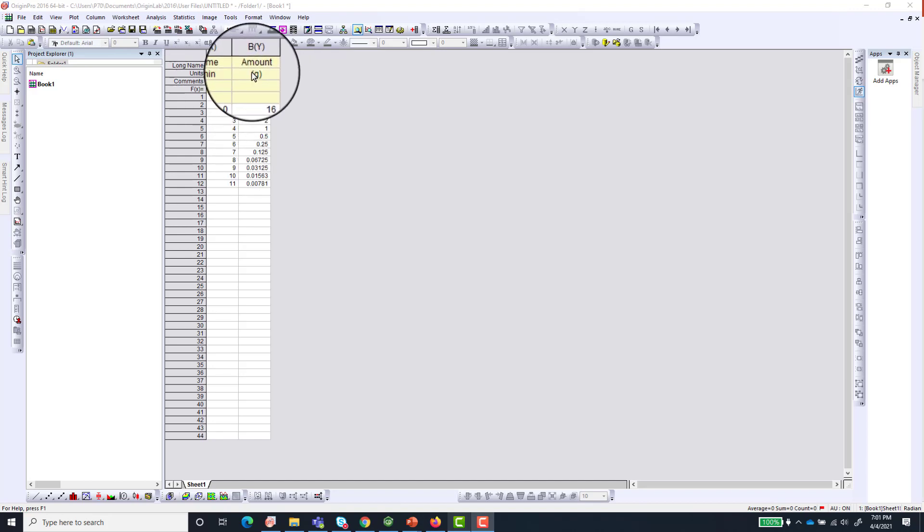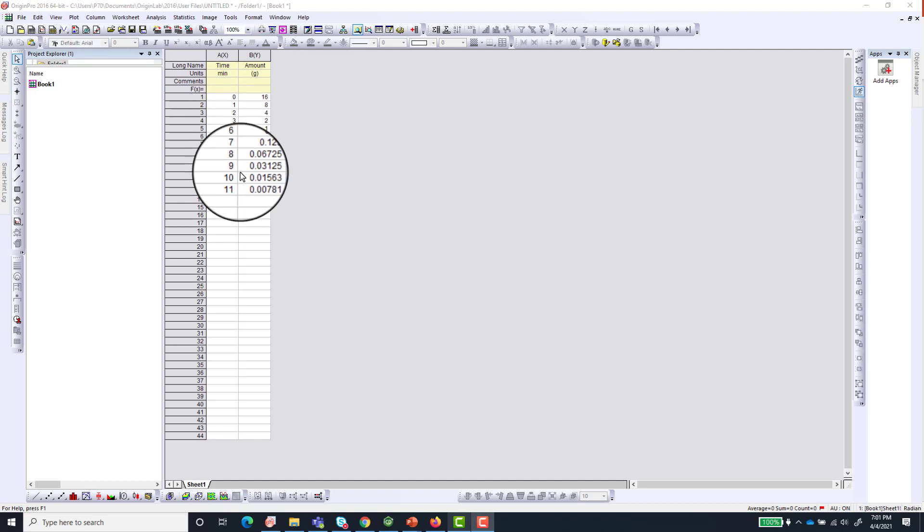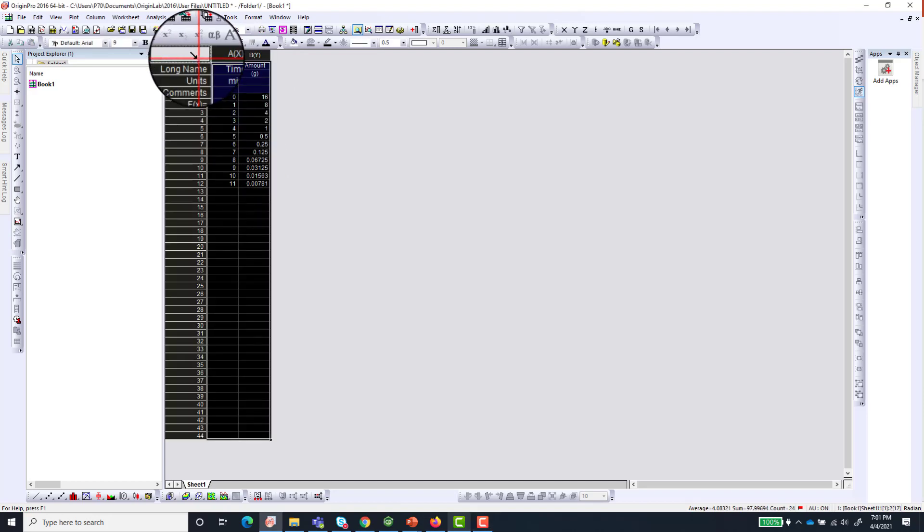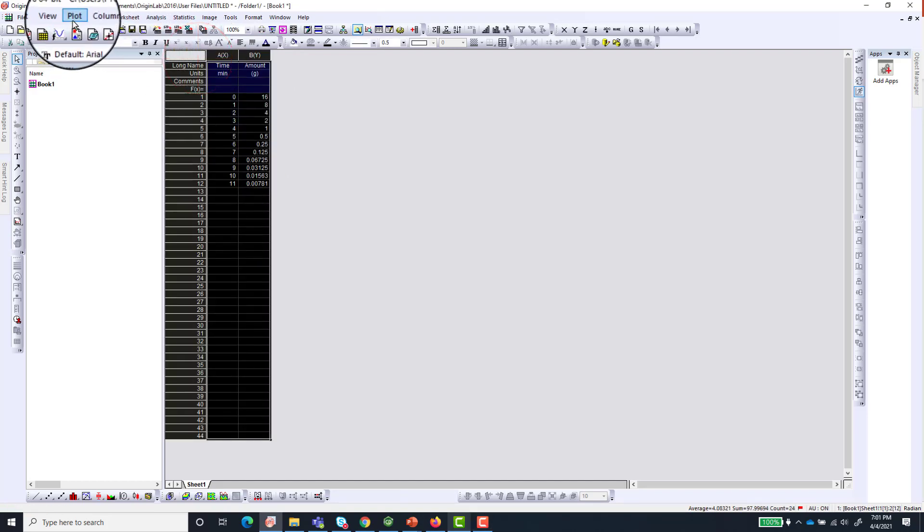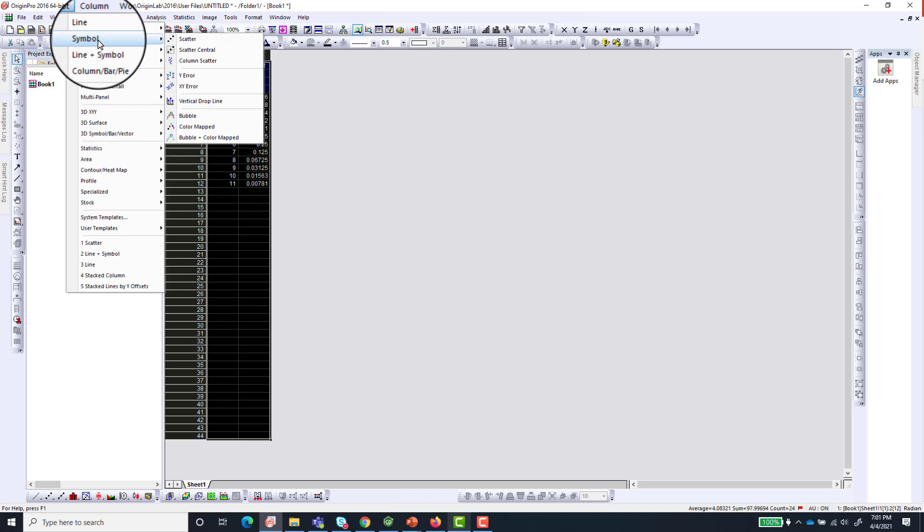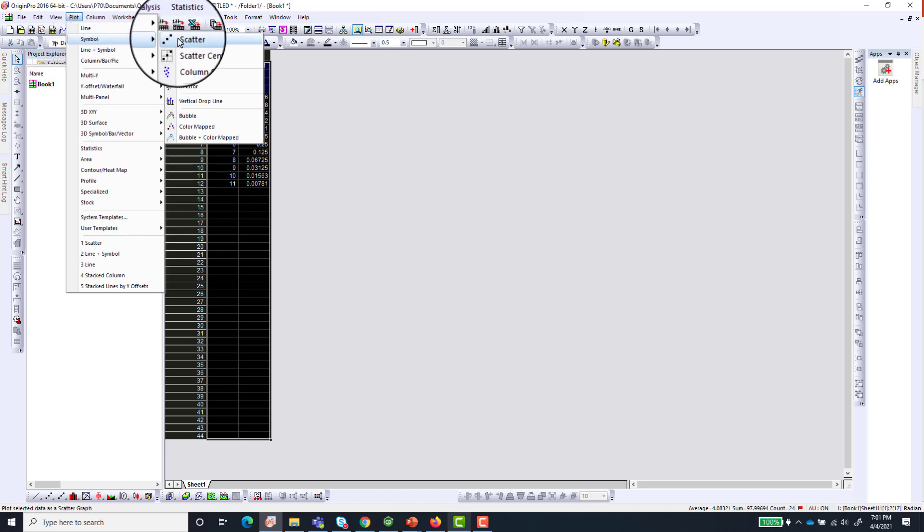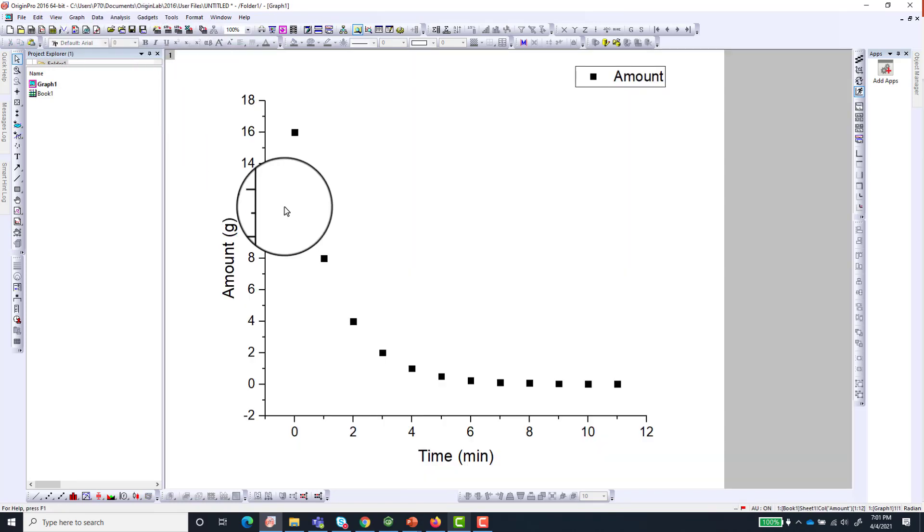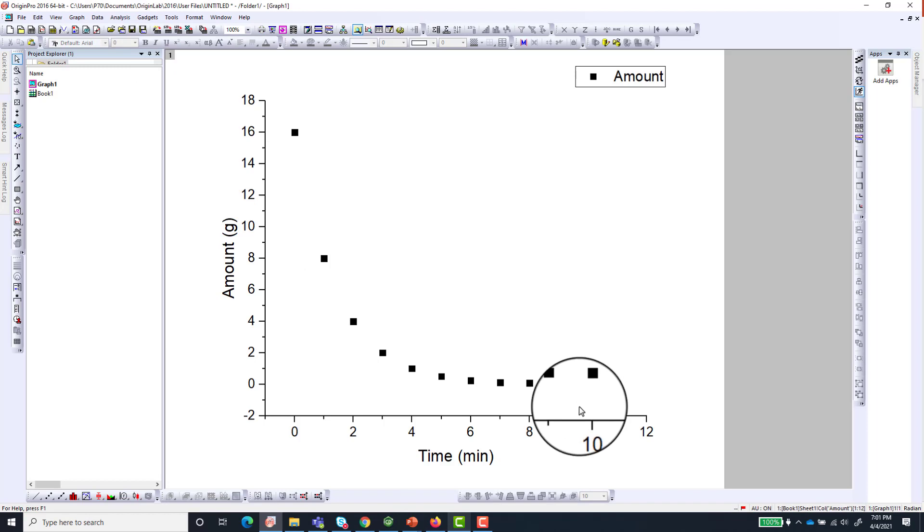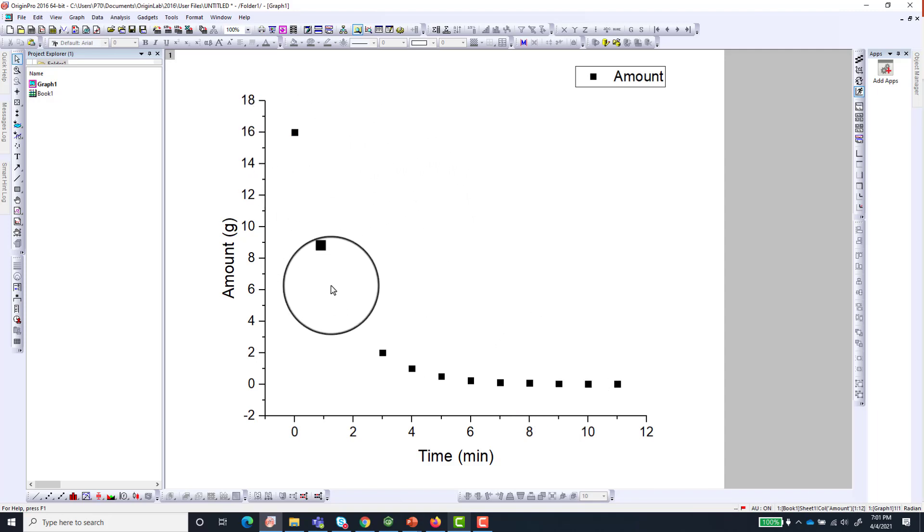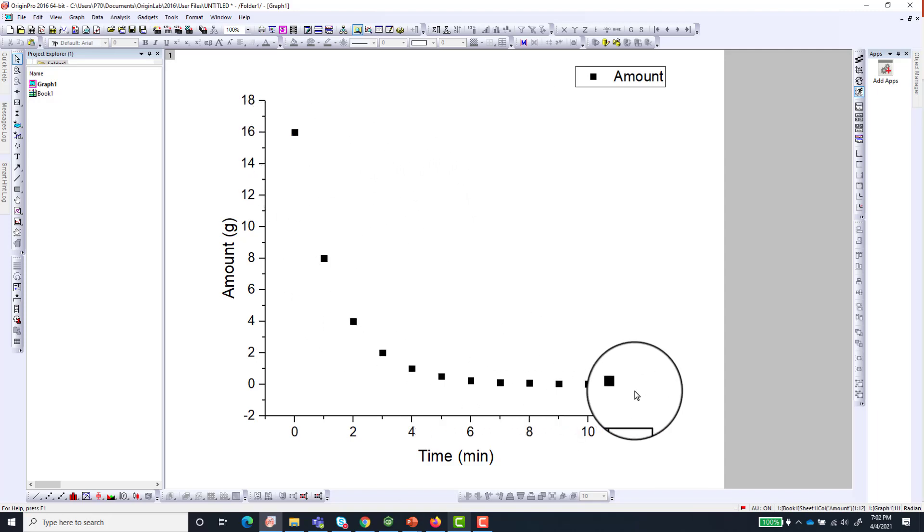So let's go ahead and make a plot of this. We go here and go to Plot and then to Symbol and then to Scatter. We will make a scatter plot. And now we have our plot and we can see that it looks like an exponential decay.